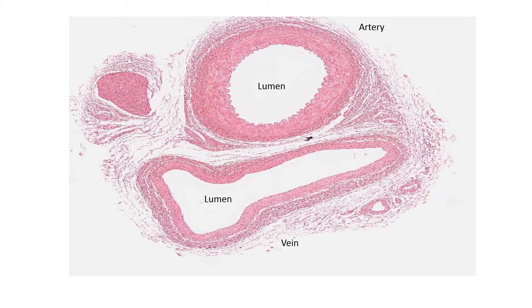Look closely at the walls of both vessels. You can see the three distinct layers.